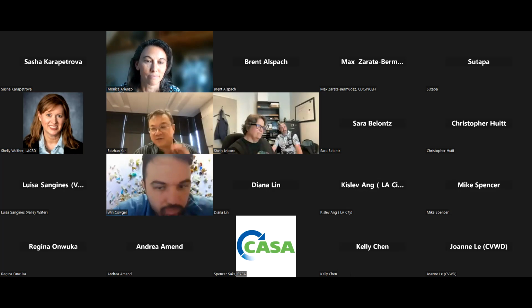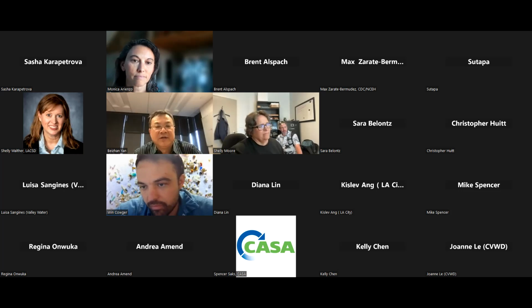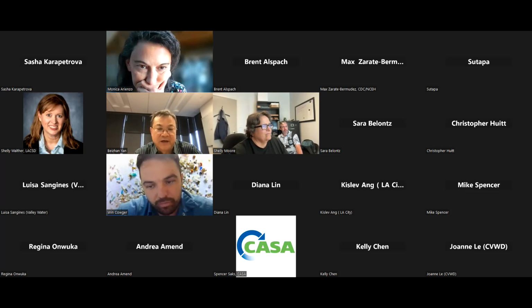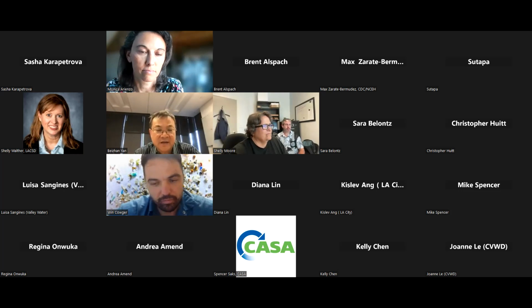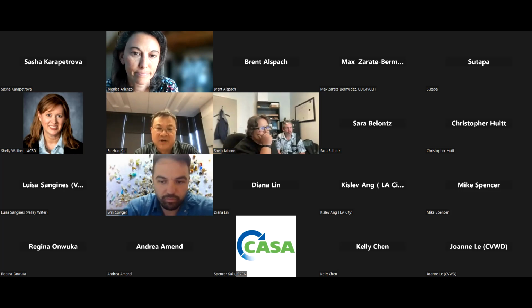Yeah, certainly. This is a really great question, and that's what our lab tries to do. In the bottled water we don't have that problem because we directly filtered the samples. We basically pour the samples onto the filters, so we didn't really touch any environmental samples. In our lab water, like molecular water, we see a lot of plastics there. So clearly that's contamination as well.